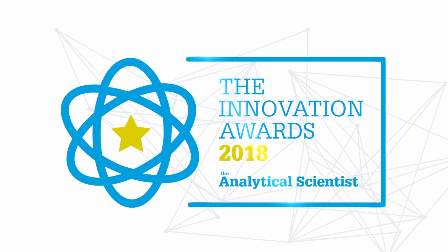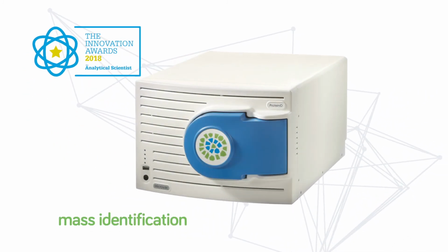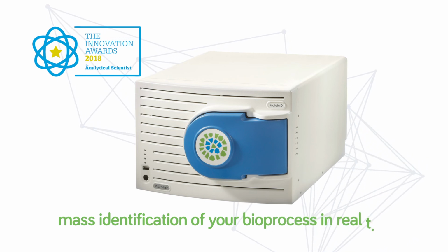Our award-winning MiD Protein ID allows mass identification of your bioprocess in real time.